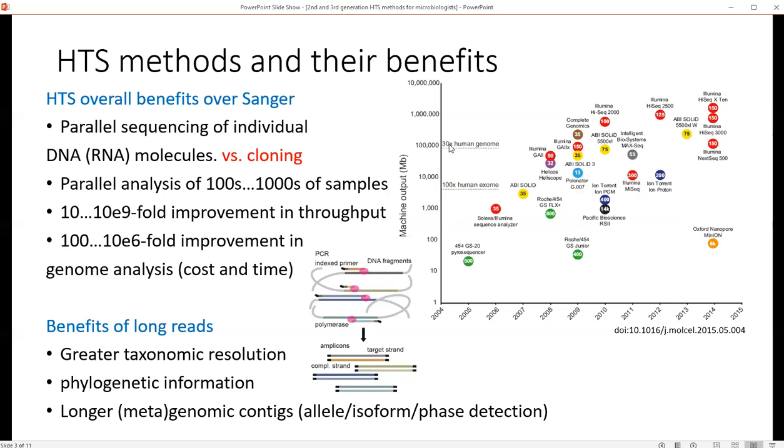What is also important about all different high-throughput sequencing methods, and especially when it is amplicon based, is that the PCR has to be performed using tagged primers, which have sample-specific indexes attached, or they may also additionally have sequencing adapters attached, so that these primers generate indexed amplicons. Also, of course, it's possible to analyze amplicon-free DNA and also RNA fragments using more specific techniques.